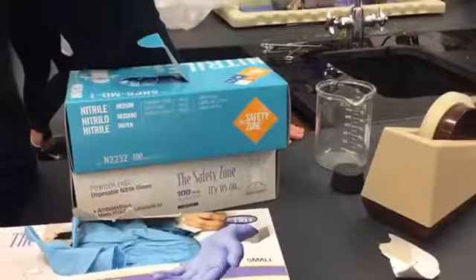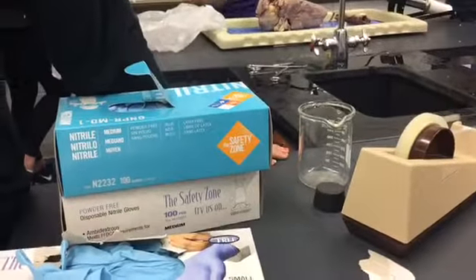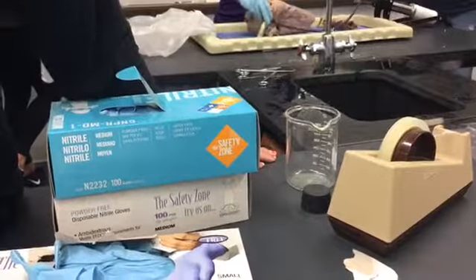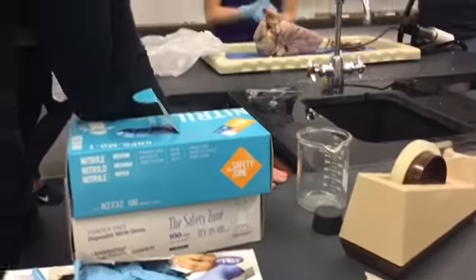Well, you know, he's been pickled, preserved, because this lived on a shelf for over a year in Bellevue West before we got to it. So it's preserved. All right, now it's your turn.